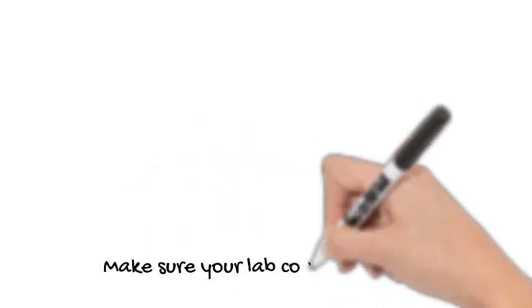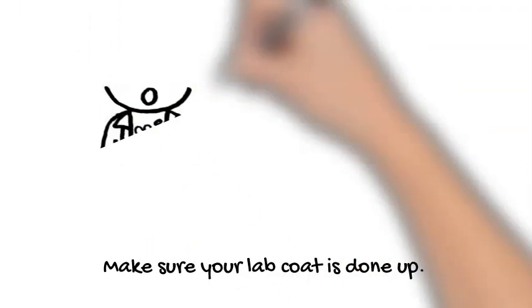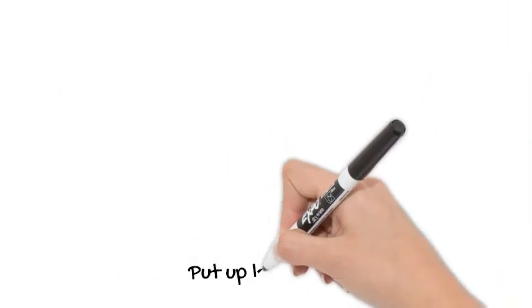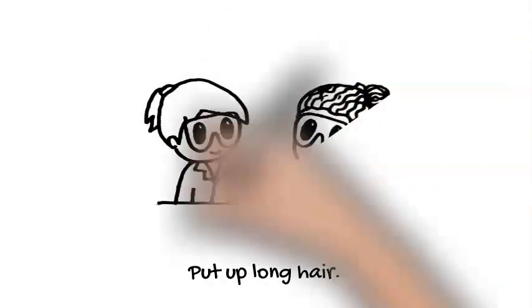Make sure your lab coat's actually done up. It's there to protect you and your clothes, it's not a fashion statement. Put up long hair, yes fellas included.